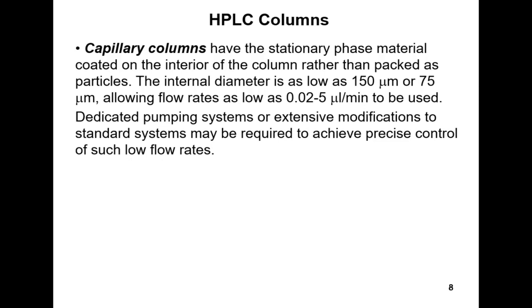And another thing, I've never actually seen one of these in person, but I don't think it's really caught on so much, especially since UPLC was developed, which I've discussed previously. But for a while, there was a trend for developing capillary columns. We'll come back to this with gas chromatography, but what this means is that the stationary phase is not in the form of small particles which are packed into the column.